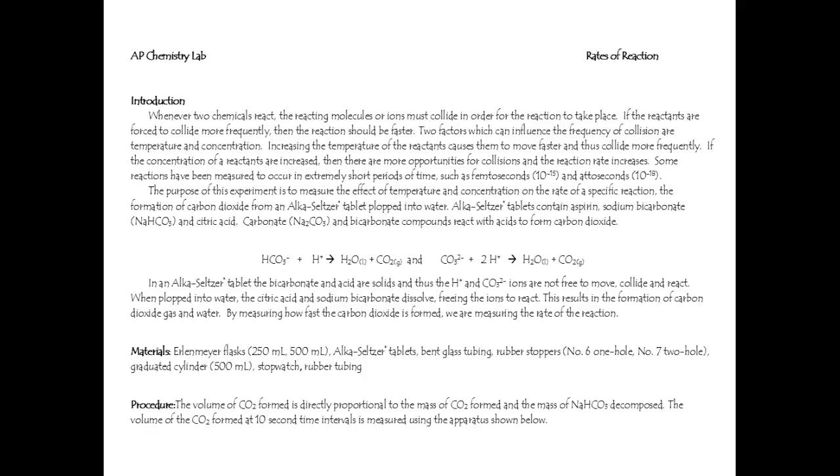Yeah, I get that. Some reactions have been measured to occur in extremely short periods of time, as few as femtoseconds to even attoseconds. Ooh, look at those cool prefixes. The purpose of this experiment is to measure the effect of temperature and concentration on the rate of a specific reaction, the formation of carbon dioxide from an Alka-Seltzer tablet plopped into water.